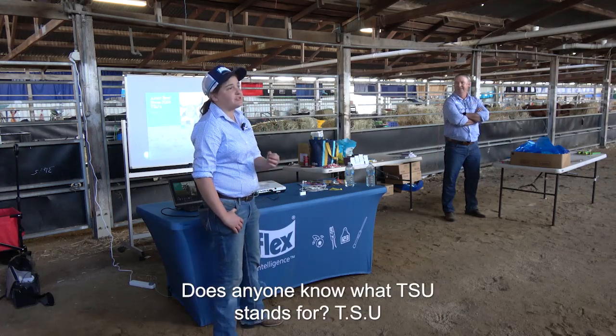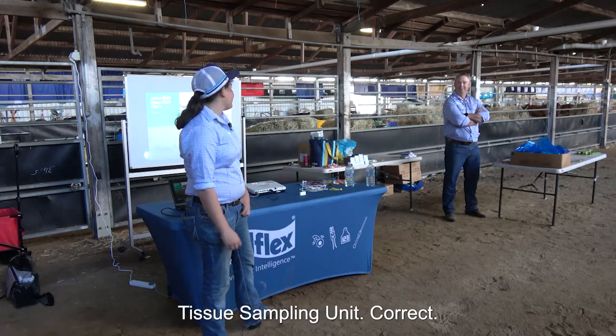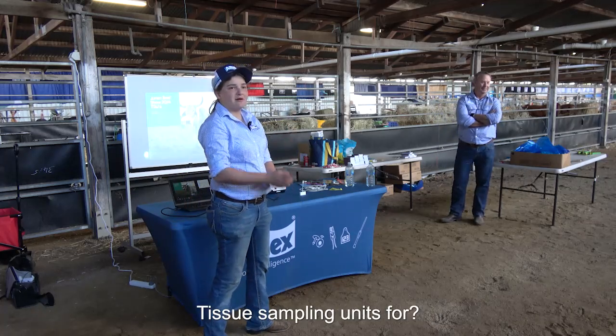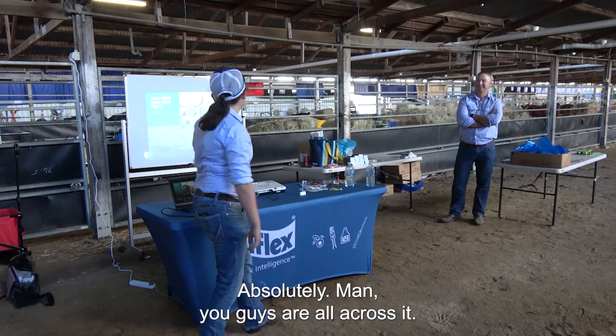Does anyone know what TSUs stand for? TSU. What was that? Tissue sampling unit, correct, absolutely. So what do we use tissue sampling units for? For DNA, awesome. For genomics, for genetics, absolutely. Man, you guys are all across it. That's easy.